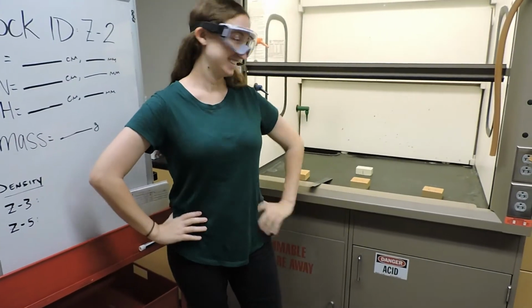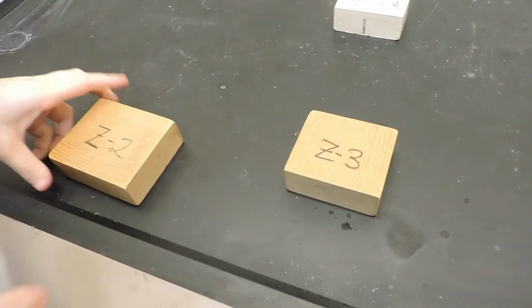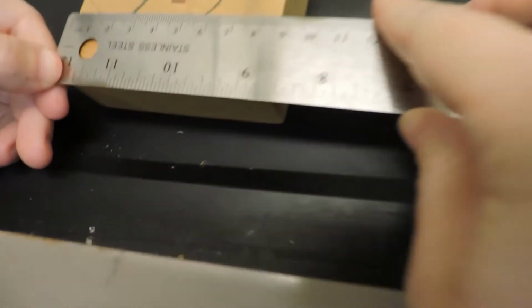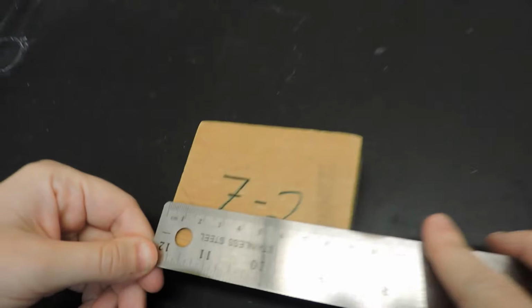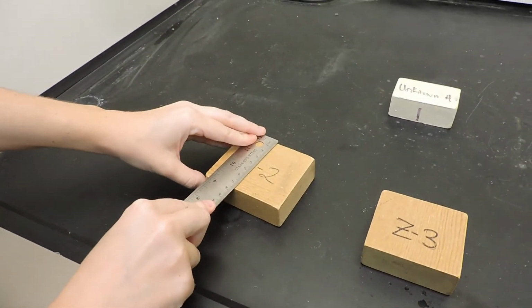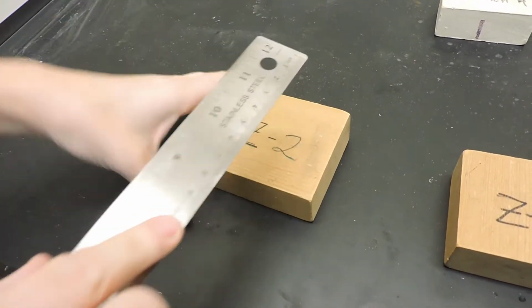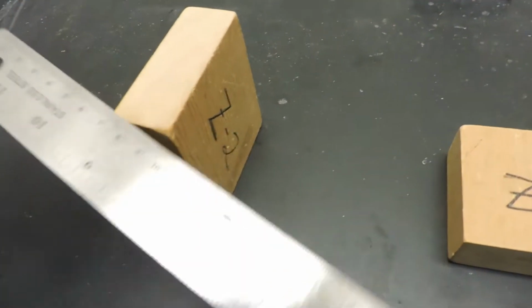Obtain a block of wood and record its letter and number. Z2. Carefully measure the length, width, and height of the block to the nearest 1/100th of a centimeter. Remember that you must interpolate between the two smallest markings on your measuring device. Report the results in units of centimeters and millimeters.